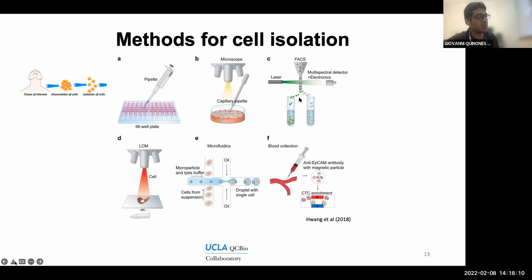and based on these properties, you can use other instruments in order to split them. I believe after they pass through the sorter, there will be a series of magnets that will help them split based on their charge.